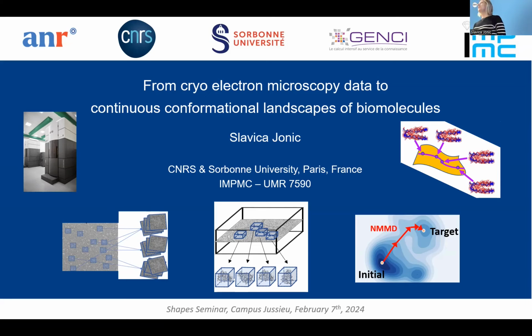With time, I specialized mostly in cryo-electron microscopy, and this is an application from biophysics, or we can also speak about structural biology. This is a domain that is not that well known, but the point is to determine the structure and dynamics of biomolecules from this kind of challenging cryo-electron microscopy data.